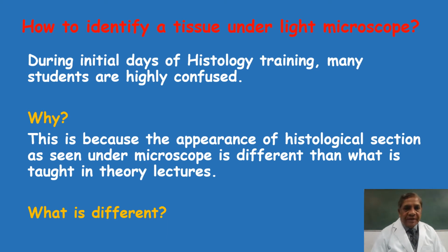Very good morning, students. In this video, I am going to tell you how to identify a tissue under the light microscope, because there is a lot of difference between what you are seeing under the microscope and what you have learned in your theory class when your teacher has drawn the diagram on the blackboard. This will not resemble what you see under the light microscope when, after the lecture, you go into the practical class.